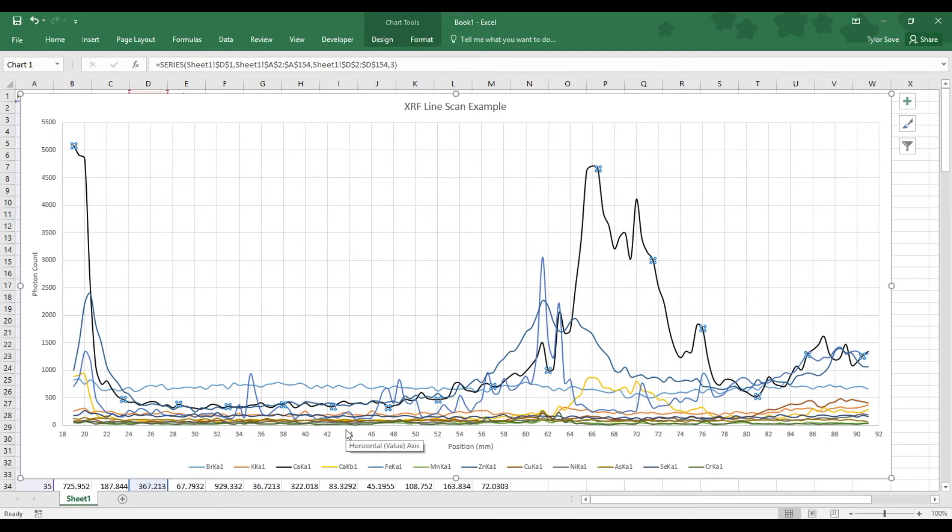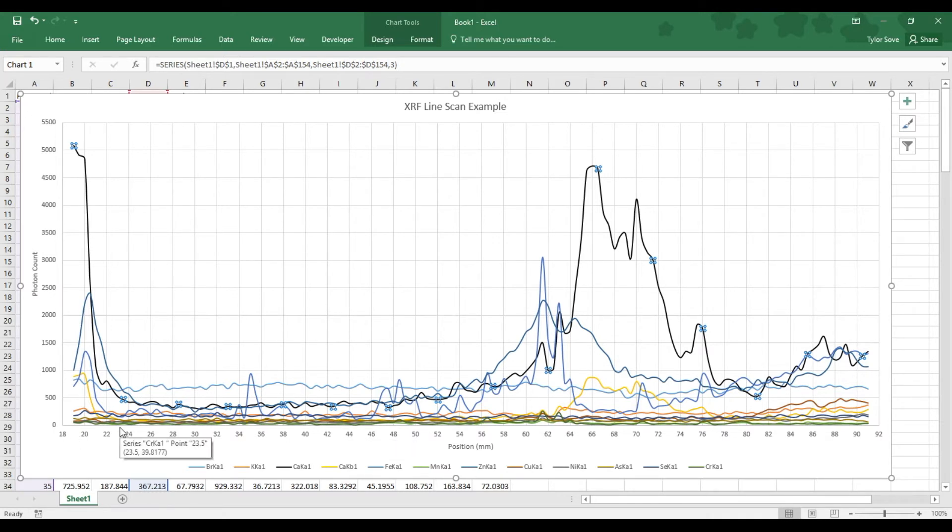That can tell you a lot. If you can correlate the position with different features—either dark zones, light zones, spots, or various interesting things about your sample—you can learn a bit about the chemistry like that.